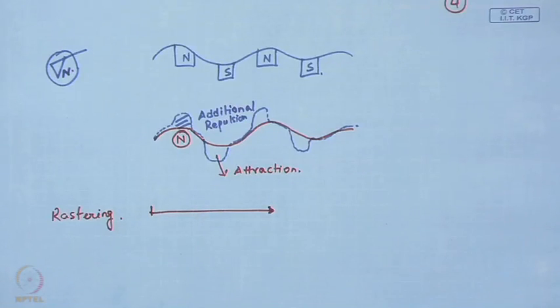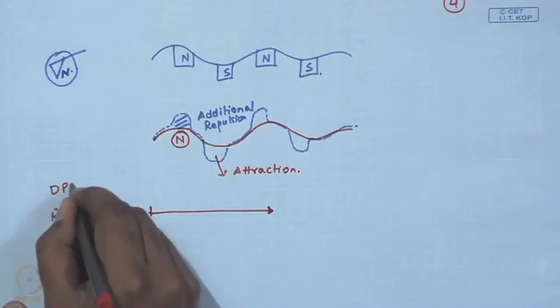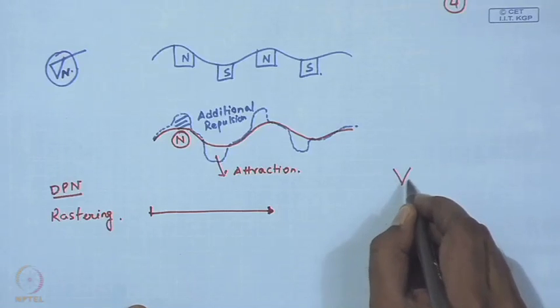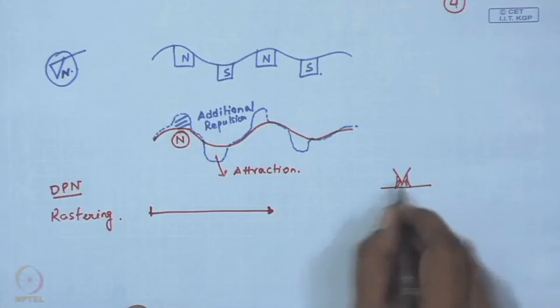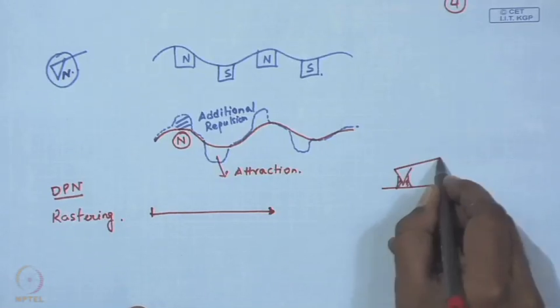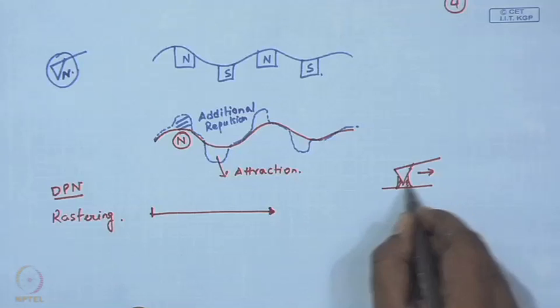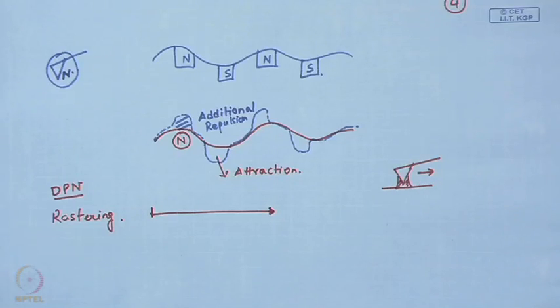And we have also talked somewhere during our discussion that during contact mode imaging, there might be possible meniscus formation due to condensation of water which is present in the surrounding. So, as you raster or drag the tip along the surface, this water meniscus also travels along with it. One can use this water meniscus which forms, or one can artificially form it by controlling the humidity, that is also possible.